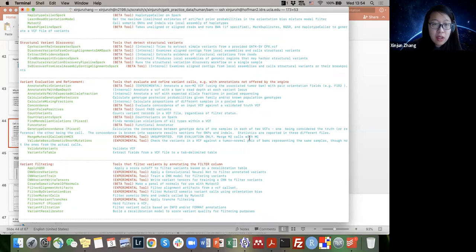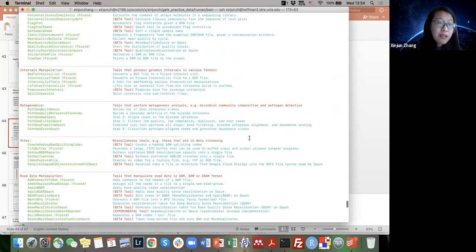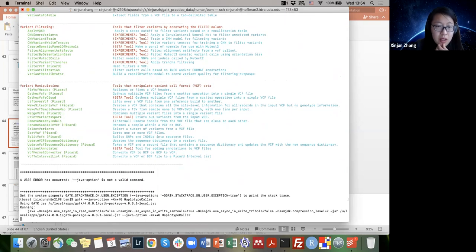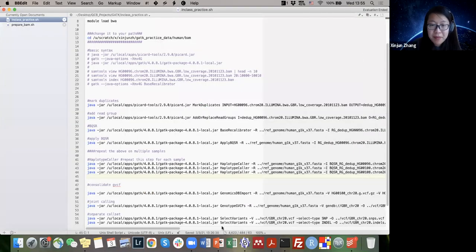Here we called GATK, and we can find HaplotypeCaller there. Let me just type this because it looks like it didn't like some of the things we did. Let's see if it works now. All right, never mind.